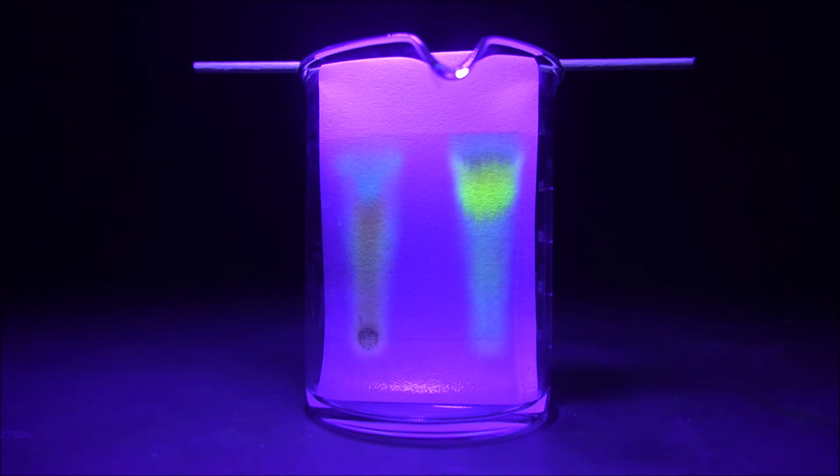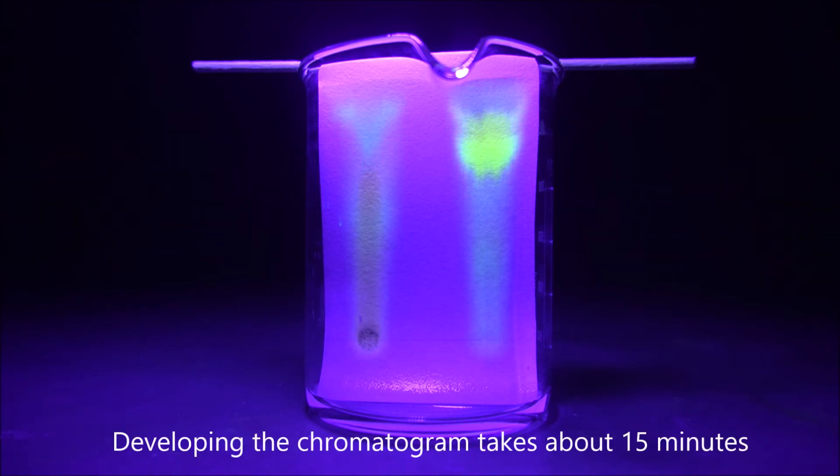The developed chromatograms show that the carbon quantum dots from citric acid and formamide on the left have blue, red, green and purple color. The black spot on the start is from carbonized reaction by-products. The carbon quantum dots from citric acid and urea on the right are mainly yellow with a smaller fraction of blue.